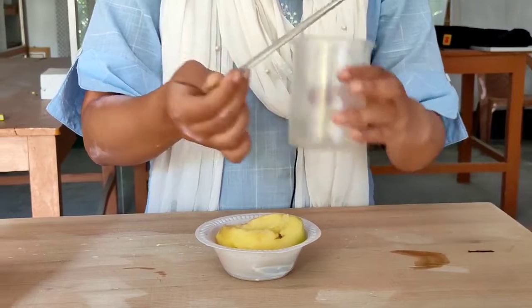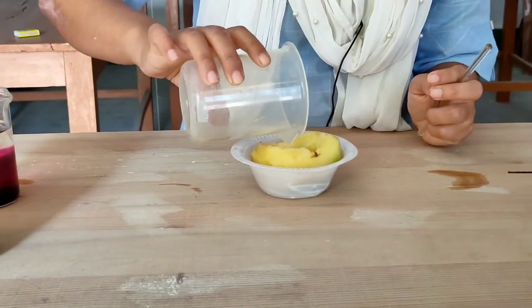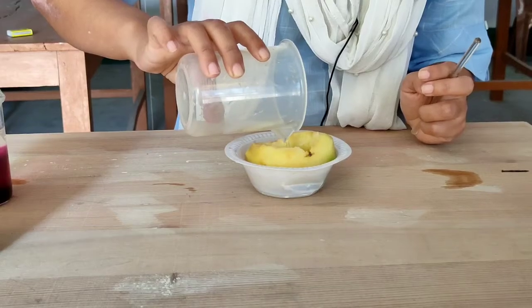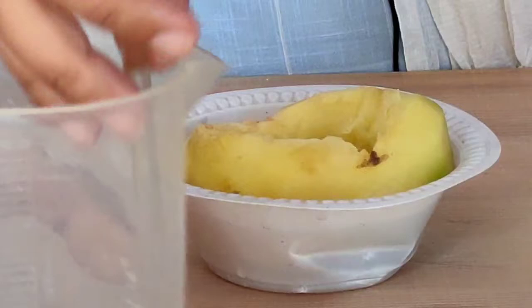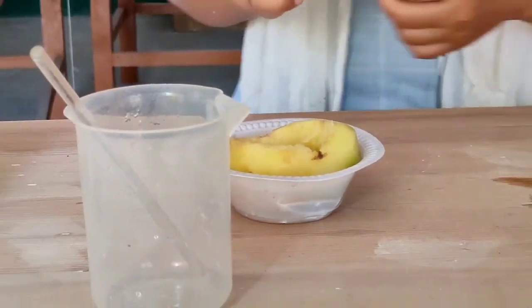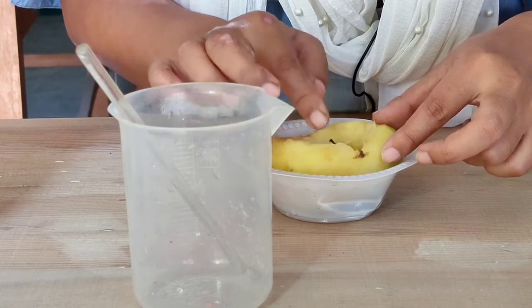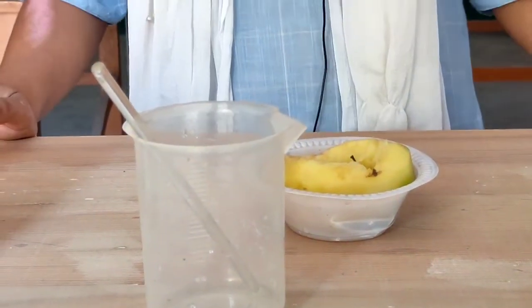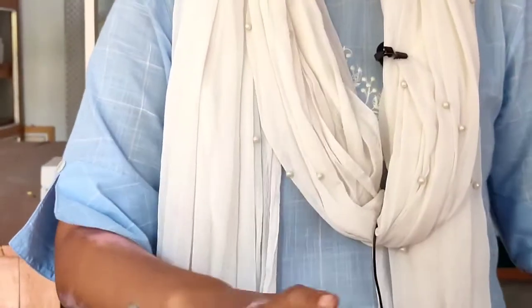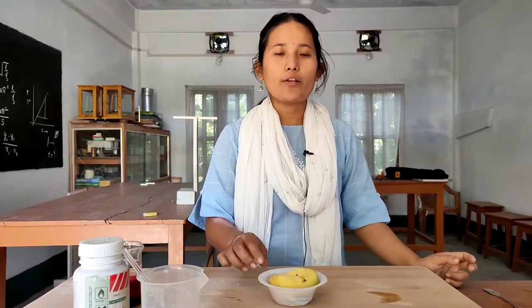Now what will I do? I will pour this solution into this hole, and then in order to mark the water level I will pin it, so that I know the initial level of water was this much. So we will have to keep this setup for a few hours, for 1 to 2 hours.